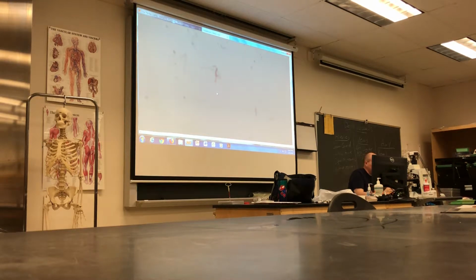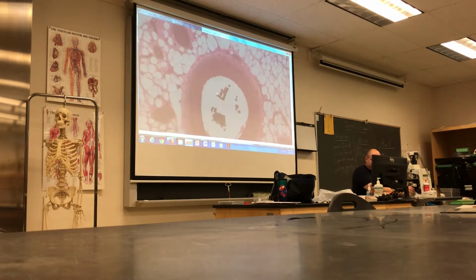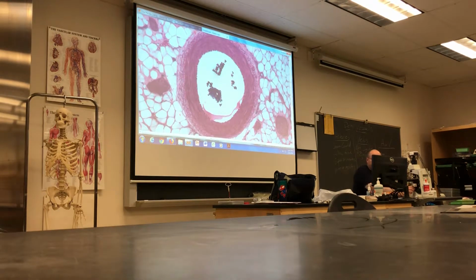Today we actually already looked at in lecture, because I gave you a lot of images of them, is the artery and vein, right? And to kind of look at here, you guys have some pretty good slides in your box on these. A lot of these are newer slides there. So the first one we're running into here, what is this, an artery or a vein? That's an artery we're seeing there, right? Kind of hanging out here.